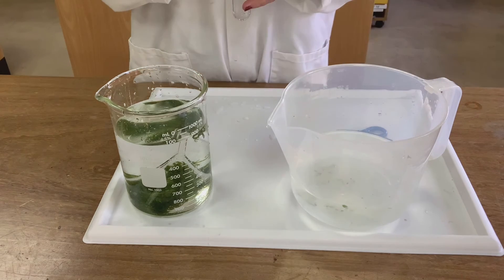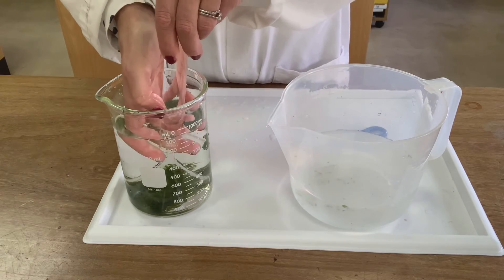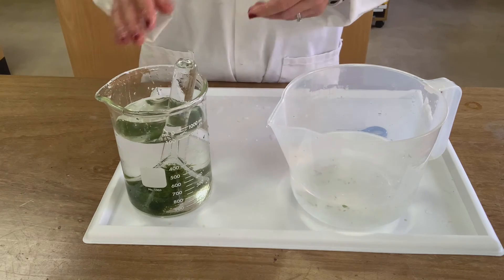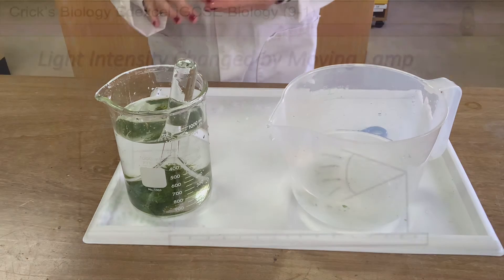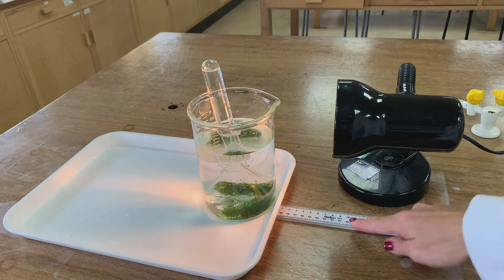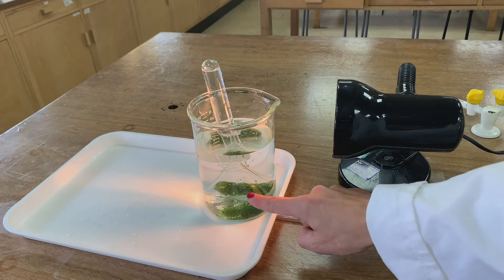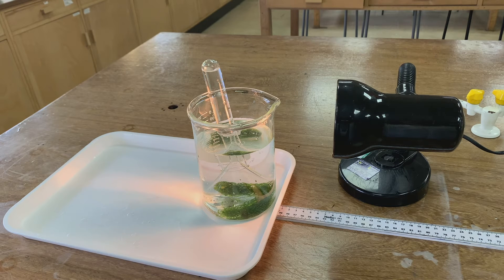We fill a boiling tube with water, then invert it over the top of the funnel, and hopefully we'll be able to see the bubbles coming up into the boiling tube. With the apparatus set up — the meter rule, the lamp, the pond weed under the glass funnel, and the gas being collected in the boiling tube — we need to make the room as dark as possible to control all the light from the lamp, by pulling down the blackout blinds and turning off the lights.